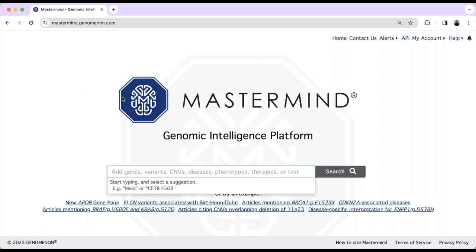All right, thanks so much, Dan, for the introduction and setting the stage for this demo. So my name is Denice. I'm a field application scientist. What that means is I spend a lot of time talking to Mastermind users, providing demos and training, and answering your technical questions. And in those conversations with users, I hear a lot of feedback and channel that directly back to Dan. We really value it, we listen, and it's because of feedback from our users that I get to come back to our users and show them how their ideas for Mastermind have actually become reality. So let's jump right in.